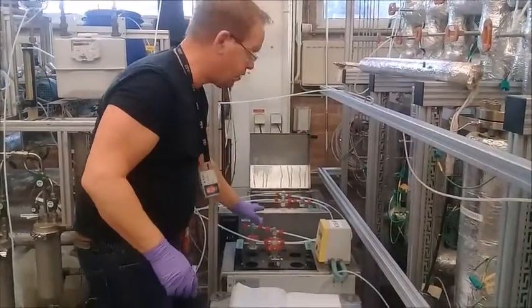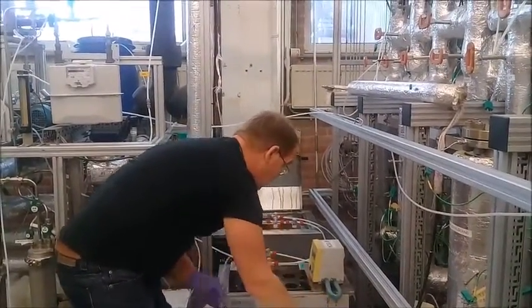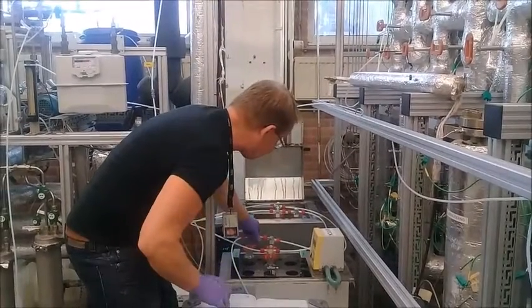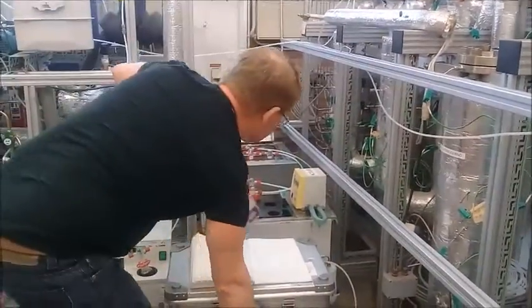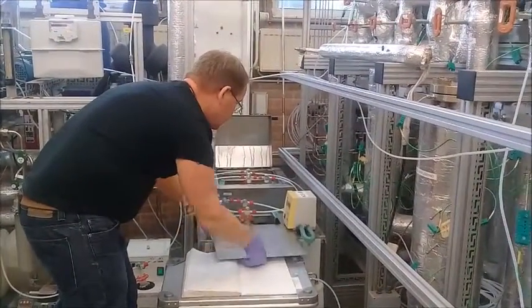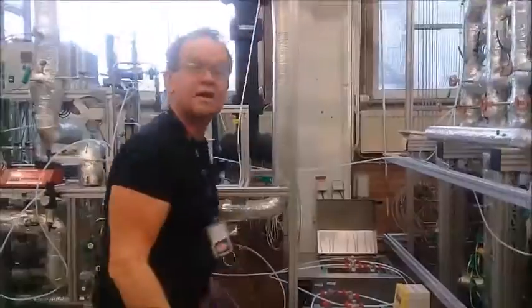So now all the 6 washing bottles are connected, and now I have to make one extra connection, and that's the connection to the gas pump, which is over here. So now also the gas pump is connected. So now everything is ready for taking the sample. So then you can start sampling now.